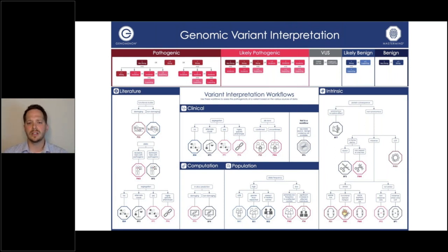And so I'll emphasize, where I talk about seven different streams of data, those six of those streams that don't include the empirical evidence from the literature are seldom, if ever, sufficient to allow you to ascribe pathogenicity to a variant. So there's really a need to have access to the information that we're going to talk about that is surfaced in the Mastermind software.